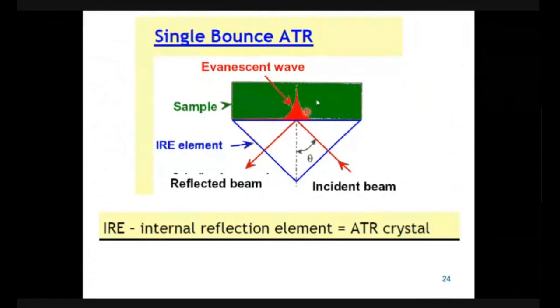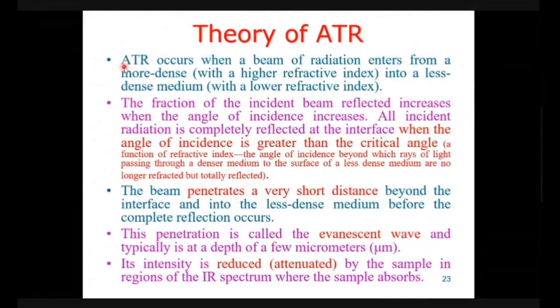Basically, when you are looking at, say, the whiteboard and I'm projecting the laser, around the laser point there is a certain region where there is actually no laser falling, but still it is glowing in the red light. So that is the evanescent wave area.